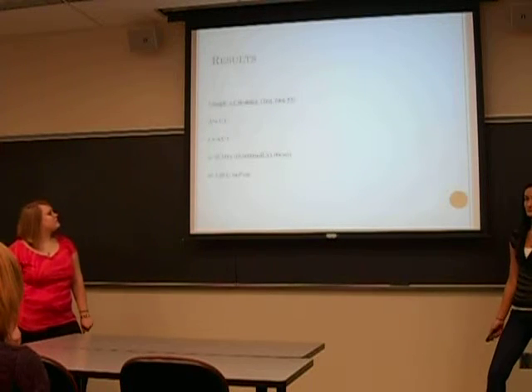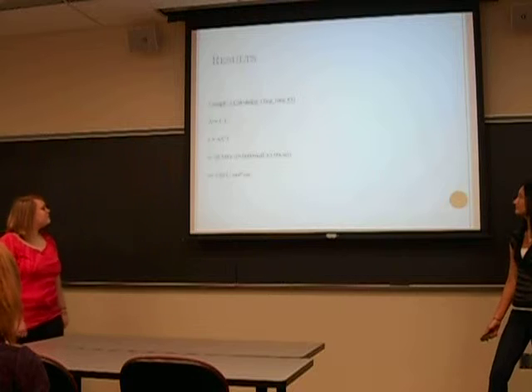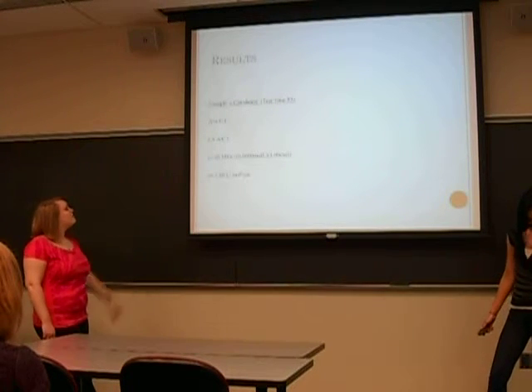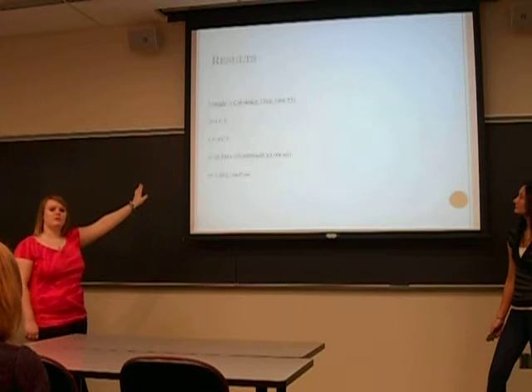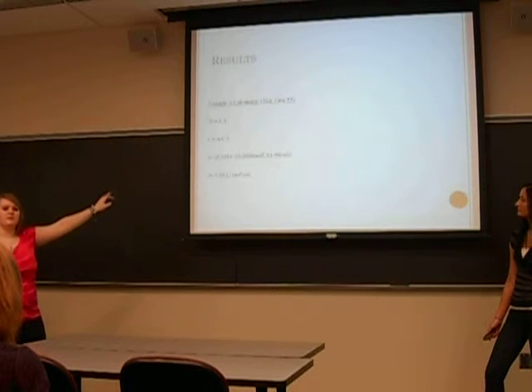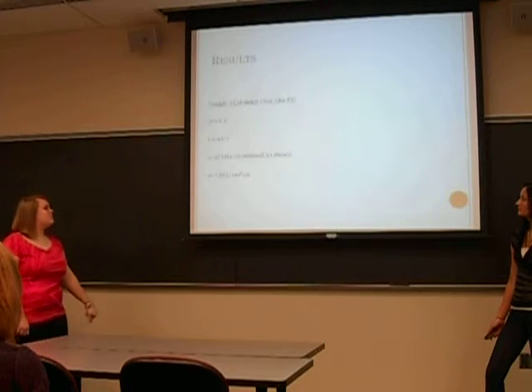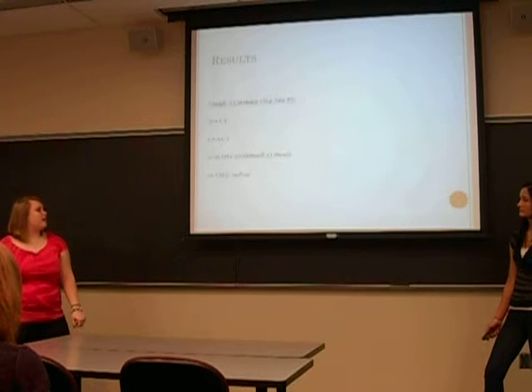And this is our calculation for test tube 3 for E. We're using Beer's law here, which is A equals E times C times L. However, we're not looking for A, we're looking for E, so therefore we will divide A by C times L. We put in our calculations and we end up with E equaling 5.8 liters per mole times centimeters.